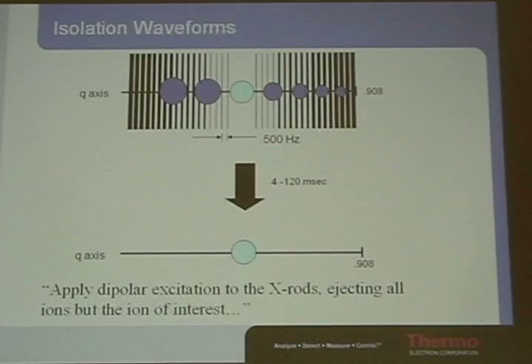But if you had all those possible frequencies, what you end up with is folded. It looks ugly, where it's somehow missing just one frequency, whatever you're tracking. You set the number of frequencies that's missing by setting the isolation width.